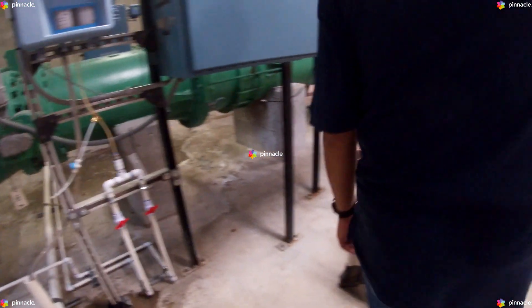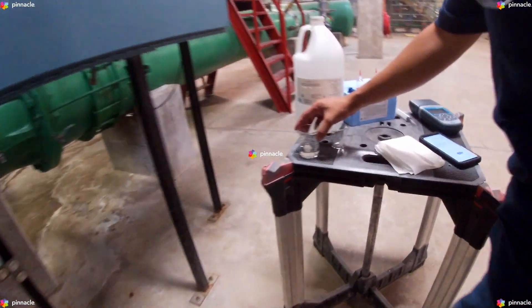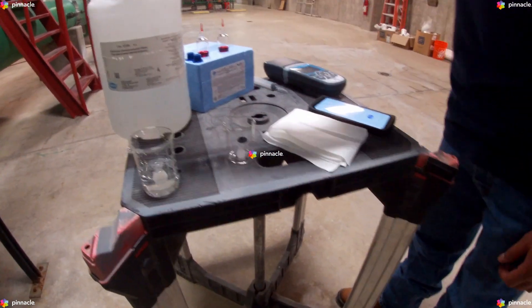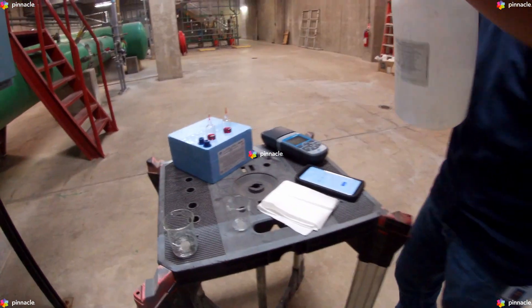We will prepare our blank by pouring at least 40 milliliters of deionized water into our beaker.